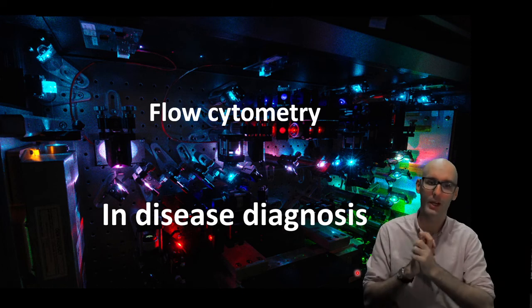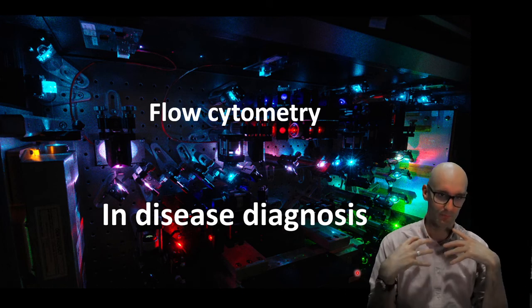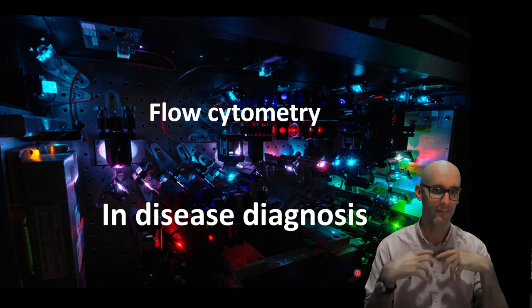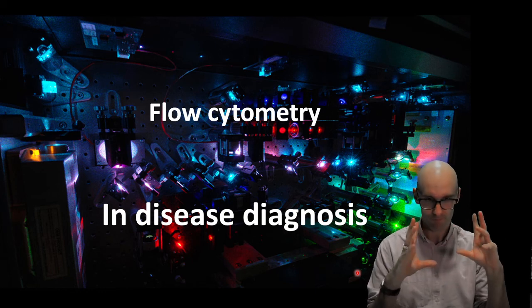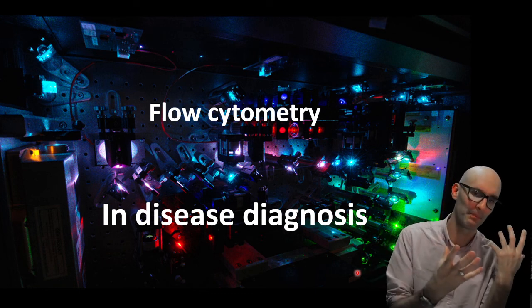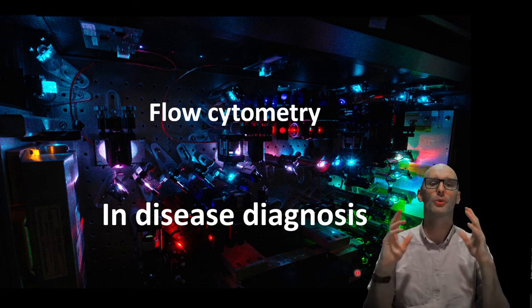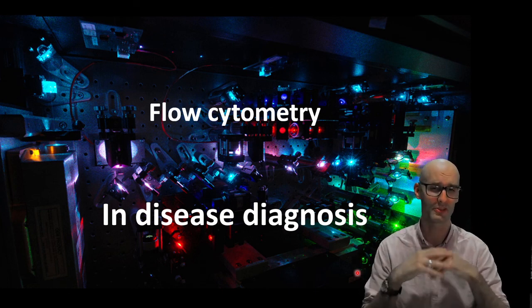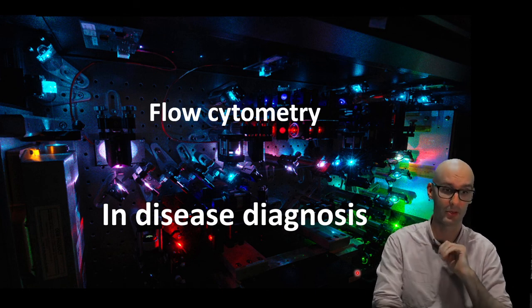So that was just a shortcut, but there are lots of things we can do in diagnosis. We can look at leukemias. We can look at whether someone might have rampant inflammation with neutrophils. We can look at all sorts of cancers of the immune cells. There are mast cell cancers. There are eosinophil cancers that cause the overproduction of those cells. So we can do a huge number of things to track cell populations with flow cytometry in the clinic to track diseases, and HIV is just a really good example of that.